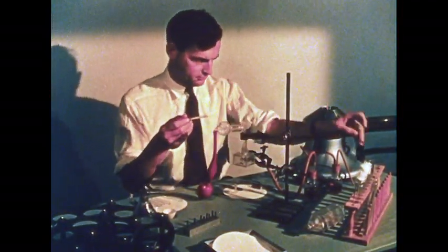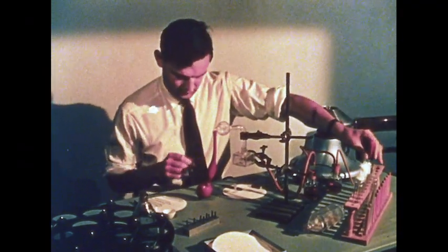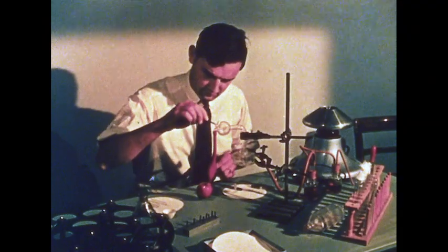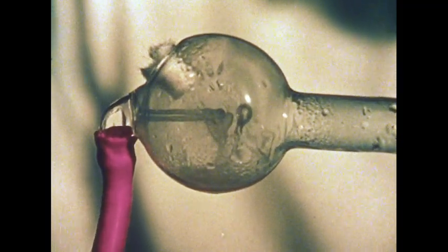The biologist, too, can confirm predictions. In the past, many diseases were attributed to minute living particles that had never been seen, the viruses. Today, many viruses can be grown in tissue cells and sprayed onto specimen grids.